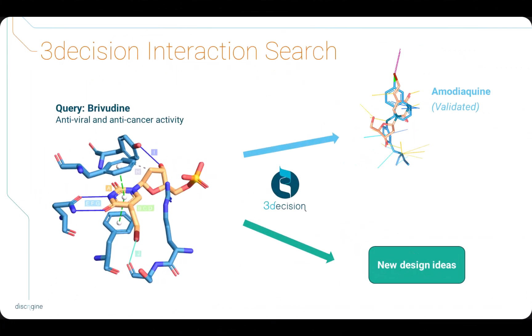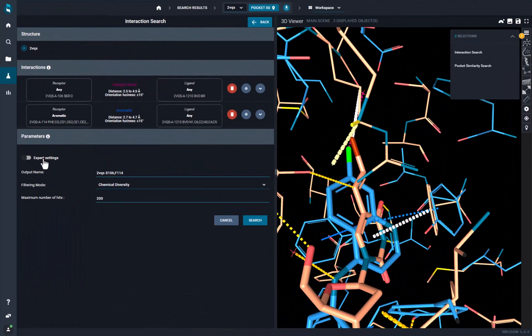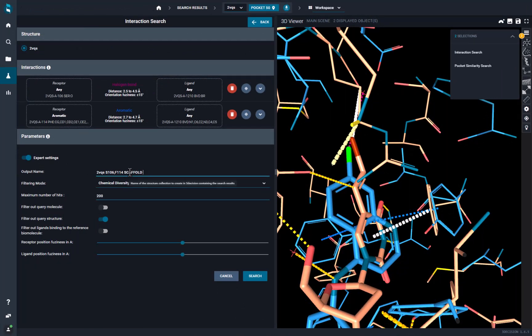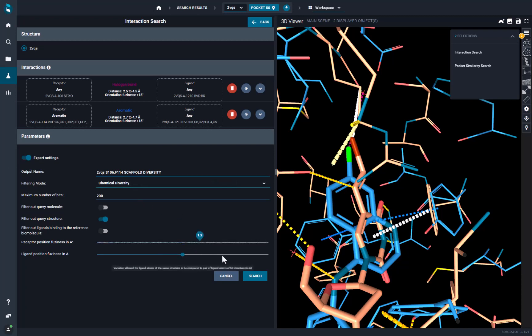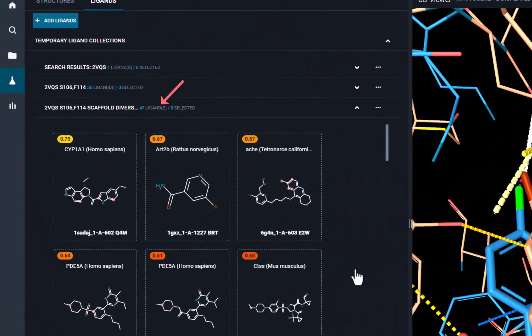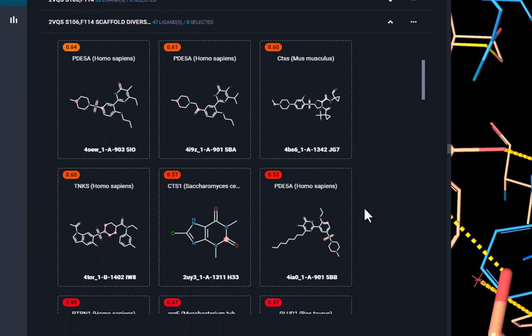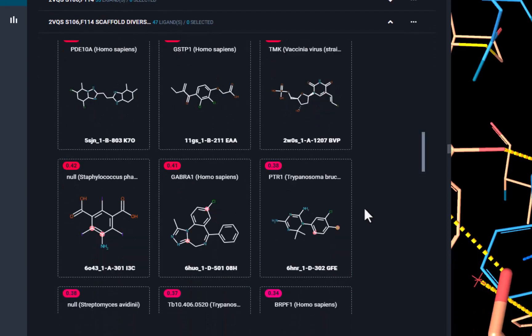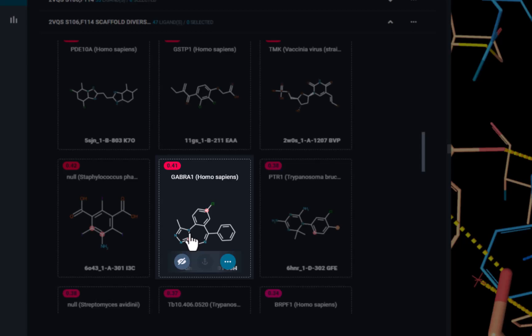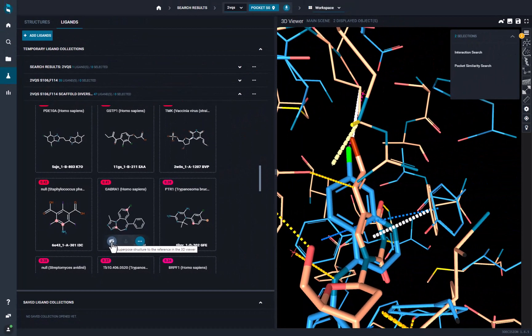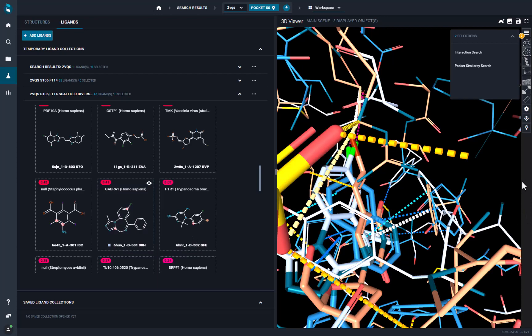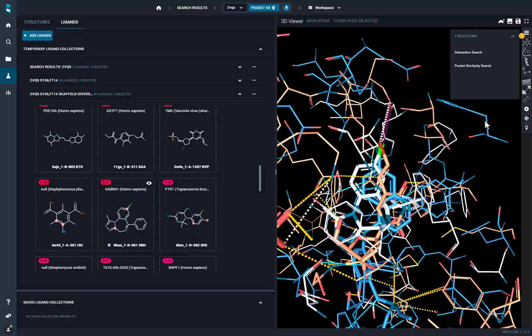Now that we validated the repurposing use case by finding what was expected based on the published data, let's go a step further. We can get more ligands that could inspire our design by increasing the fuzziness of this search also on the ligand geometry. This will allow us to obtain higher scaffold diversity in the hits. We see that the number of results increased. For instance, we get a benzodiazepine that was not obtained from the previous search, which could be a good starting point for repositioning or to modify the chemical scaffold of our ligand.